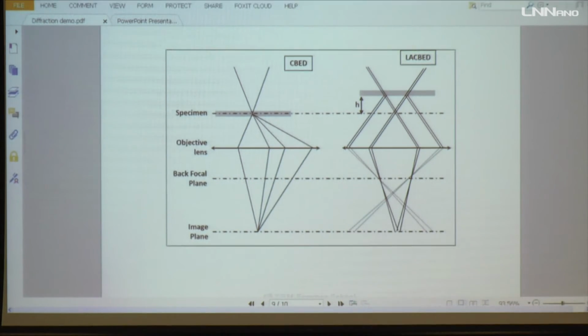Next, I think I have another 10 or 15 minutes. I want to finish a little bit quicker, because yesterday there was some kind of confusion, as the bus leaves by 5:30. So I want to finish maybe by 5:20 or something like that. I need to show you guys thickness fringes and deviation parameter. These are the two things I need to show you. And for quantification of these thickness fringes, I will discuss more in my Monday's talk.